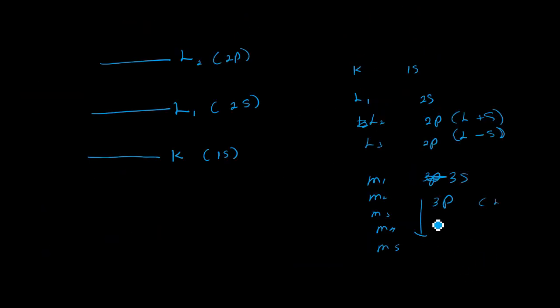Likewise, there are different kinds of Auger processes: KLL, which is the most common, then LMM, then MNN, then NOO. LMM means the initial electron comes out of the L level, and both the electron that comes down to occupy the vacancy and the Auger electron are on the M level.